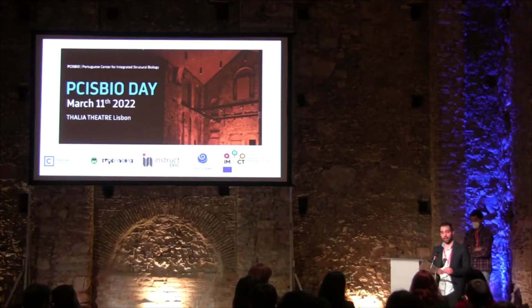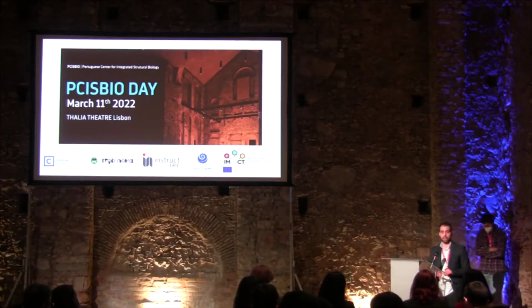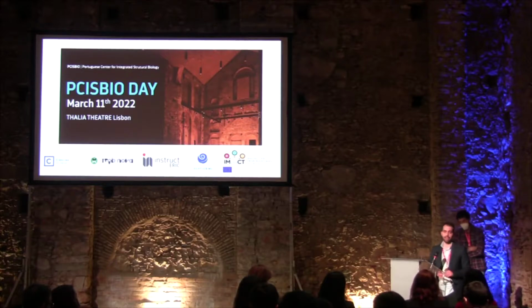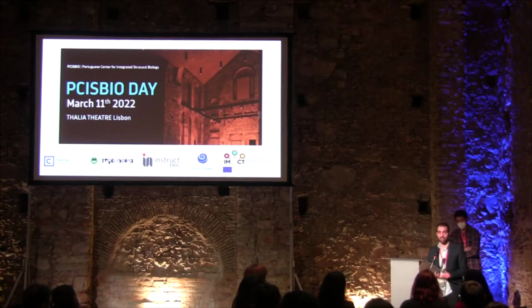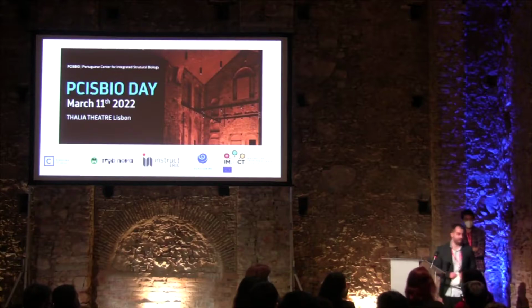And for the experiments, they take about 1 month estimated. And then we send again the protein for us. We purify the protein, and it's about maybe 3 months, 4 months. Thank you very much.